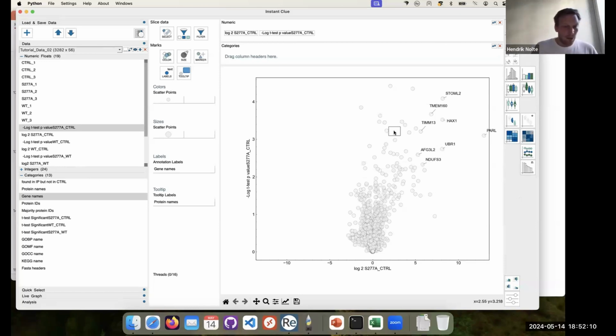So let's say we have, as I mentioned before in the presentation of the data sets, a column which is called t-test significance, which indicates by a plus sign if that protein is significantly changed at a certain FDR. So here we have plus signs and minus, and we could use that to visualize and encode by color which are the most interesting ones, because the significant ones for us in this data set are the interesting ones.